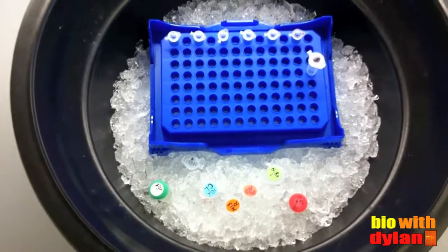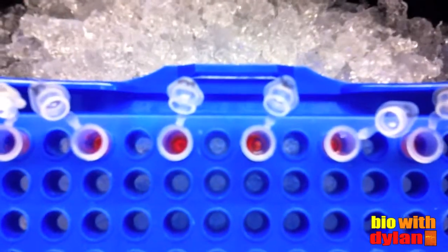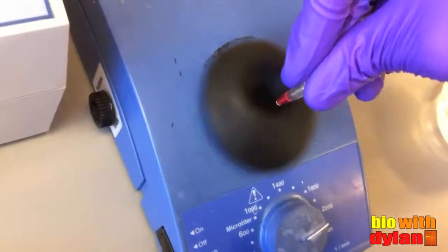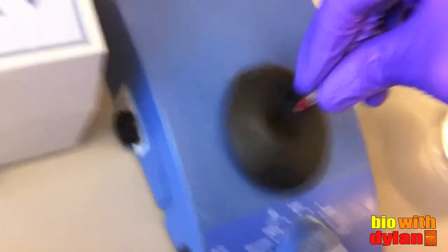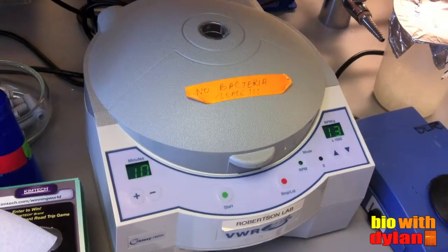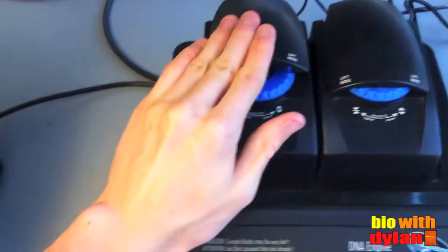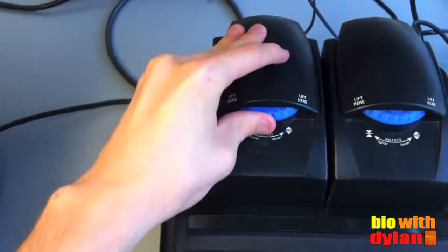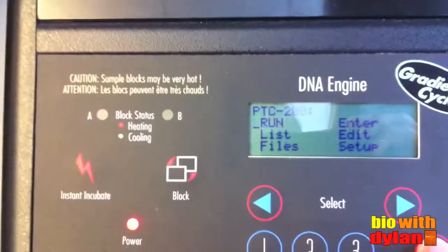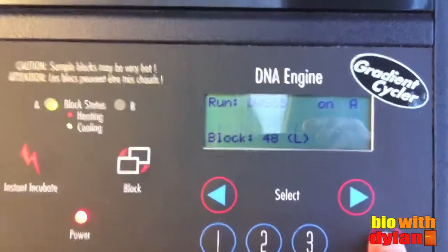I'm gonna turn you into a PCR reaction. That was super quick! The red dye you see is the PCR buffer. Quick vortex so everything's mixed together, and spin them down. Load the samples into the PCR machine, push a few buttons, and hope for the best.